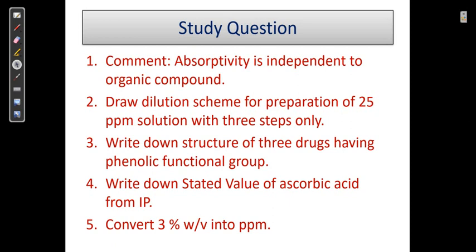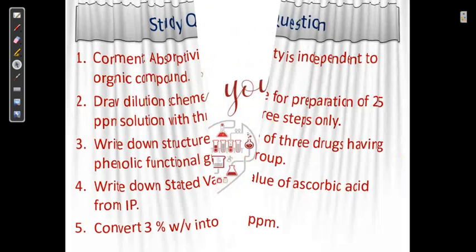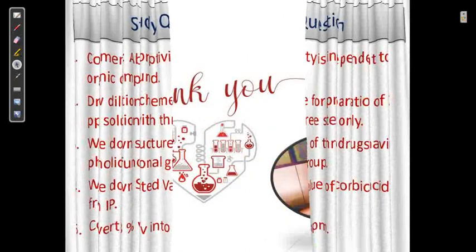So this is the procedure, assay, calculation. For the calculation, I have prepared one video that you can see in the right corner of your YouTube. I will upload a further video for this one and you can share to your colleagues to understand the procedure for assay IP'96.